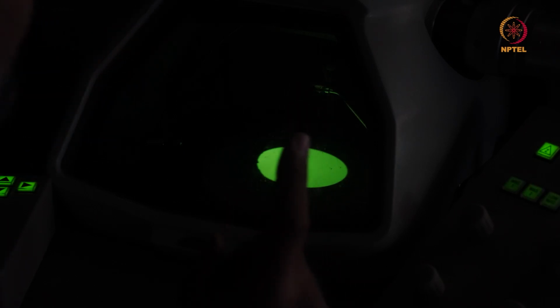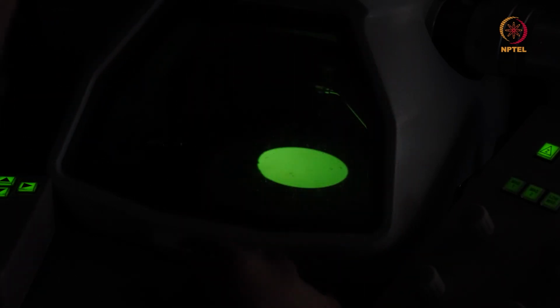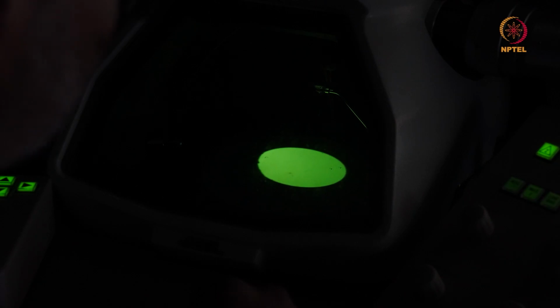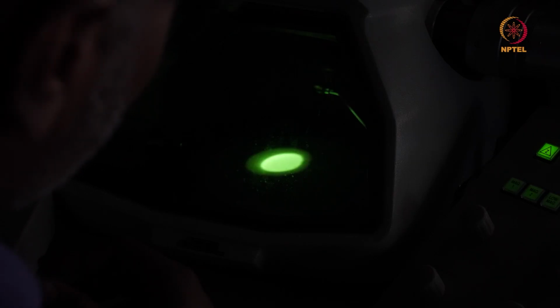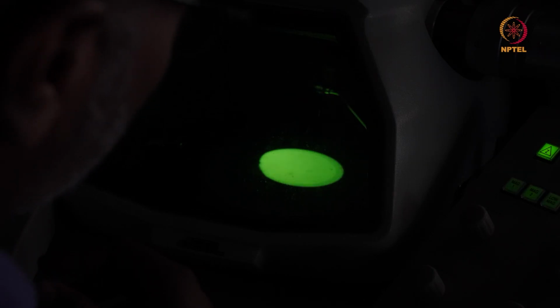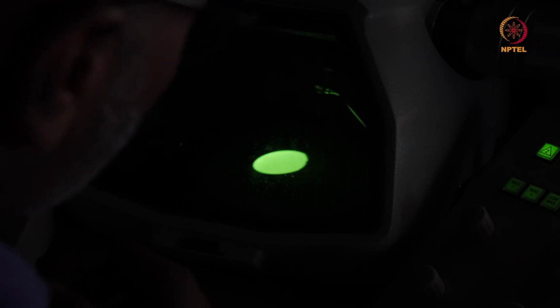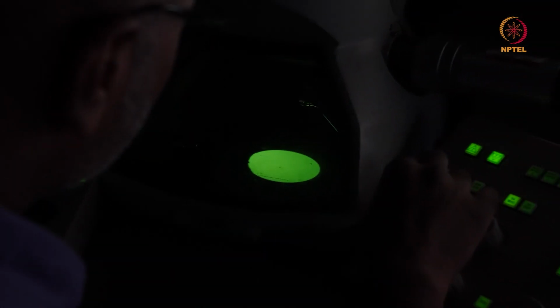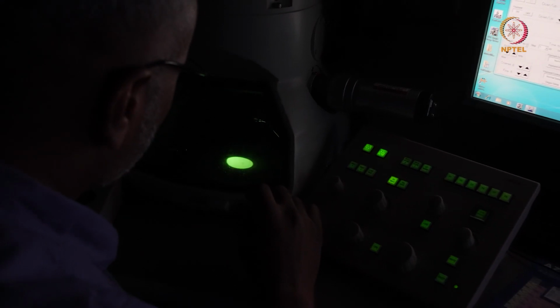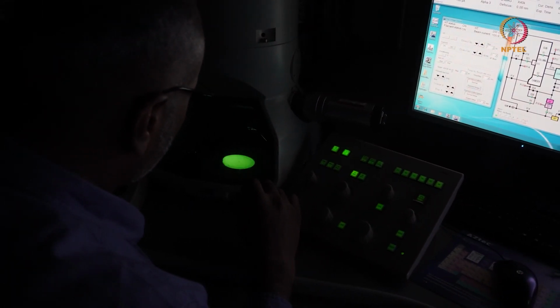Bear in mind, you might be looking at a recording which is at an angle, so in the video, it may not really appear circular. But the first step that I need to do is ensure that my aperture is aligned. What do I mean by aligning the aperture? When I turn this way, the shadows of the edge of the first condenser aperture should coincide at one point. So I'll now use the Shift X and move this to the center. And here is my crossover point.